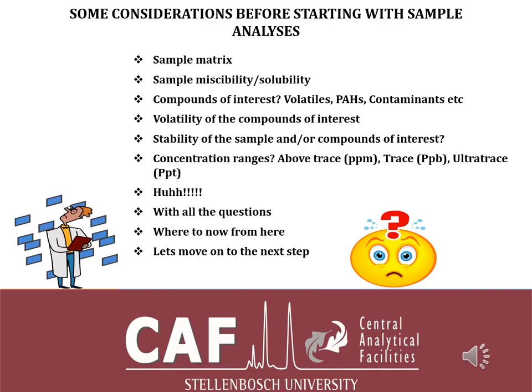Or if your compounds of interest are very volatile, you might have to prepare your samples in small batches. Especially if your lab is not cool enough, your aircon is not performing well, you can prepare all your samples and keep some of them in the fridge until they're ready for injection. Maybe depending also on the length of the method, you might have to add on your samples in an hourly period, for instance, your first 8 samples, and then the next 8 before you go home. And also, the other thing that's important is the concentration range that you're working with.